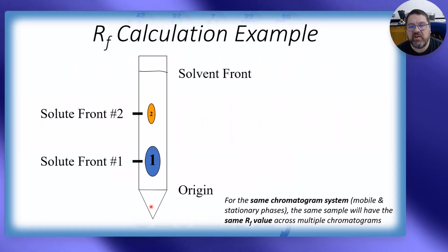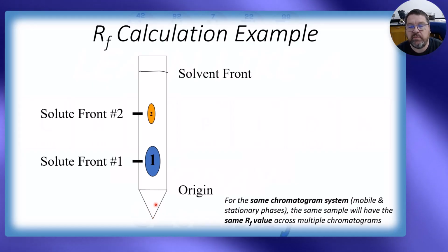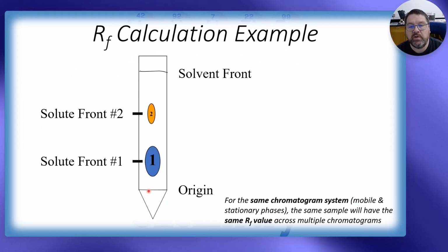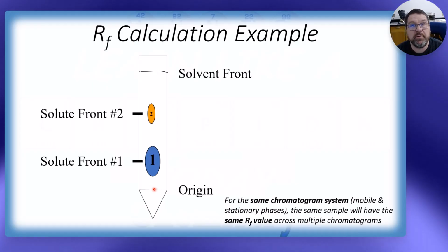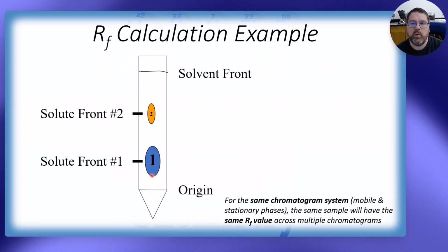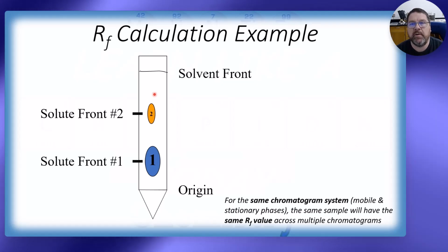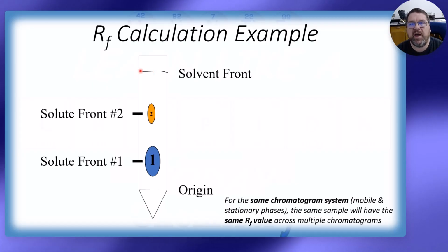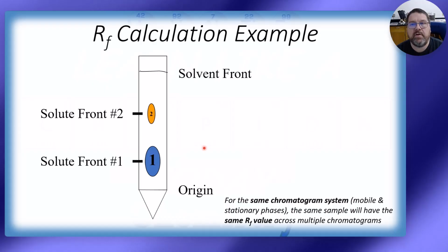And then as you place this in the chamber, the solvent, the mobile phase, is going to begin via capillary action to move upward, and as it passes the sample line, the origin line, it's going to dissolve the mixture into each of its components. And as you now have kind of a battle between the affinity for the mobile phase versus the stationary phase, the different components will be teased apart. And so as that solvent begins to near the top, you would pull it from the developing chamber and mark, again in pencil, that distance that it traveled. And then you need to make some measurements.